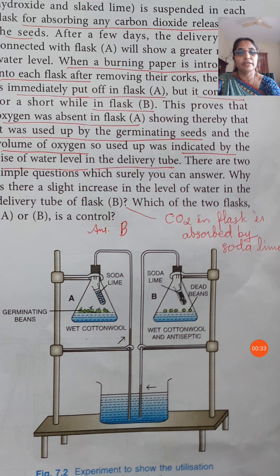In both flasks, wet cotton wool is placed for giving moisture to the germinating seed.